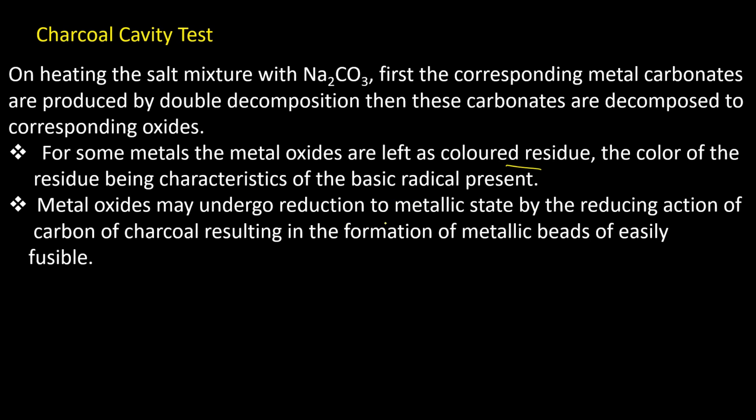Metal oxides may undergo reduction to the metallic state by the reducing action of the carbon of the charcoal, resulting in the formation of easily fusible metallic beads. So this reduction takes place not only in the reducing flame, but even by the carbon of the charcoal.